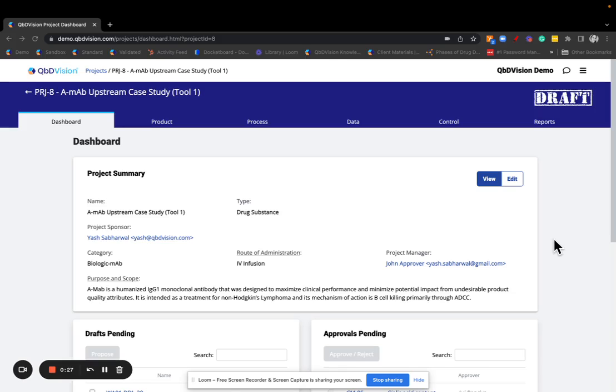Your quality target product profile helps you ensure that your critical design processes are in accordance with your CQA goals, making it possible to minimize deviations and quickly troubleshoot problems. We make it simple to link your control strategies and ultimately implement more comprehensive quality systems.